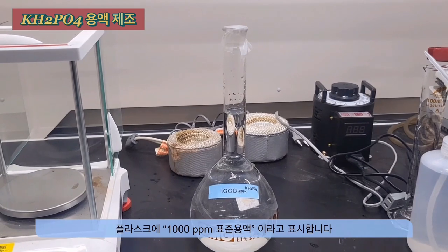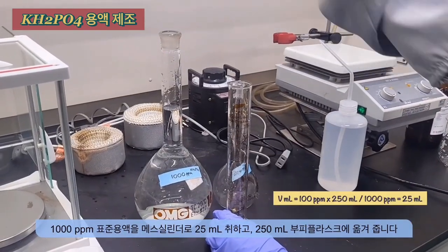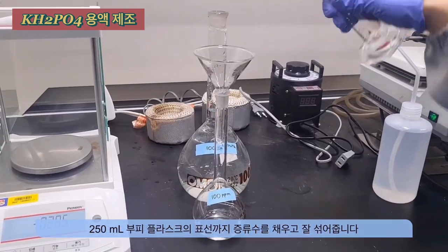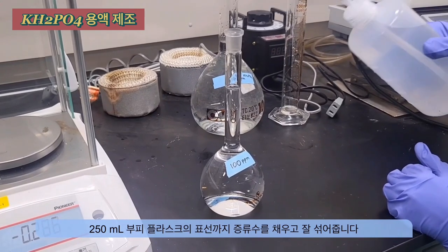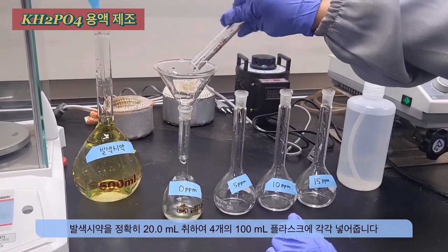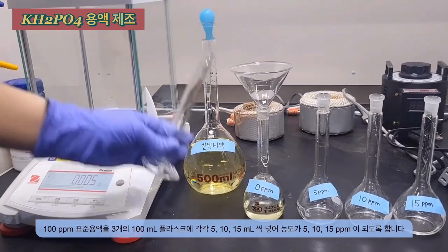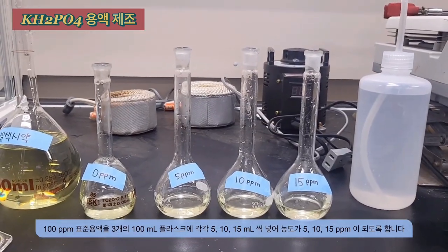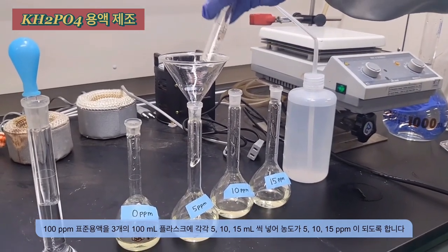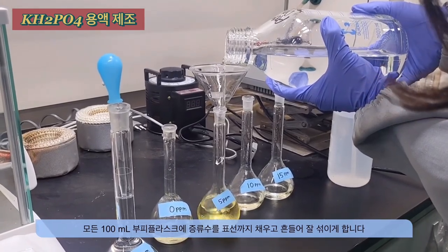Label the flask as 1000 ppm standard solution. Now dilute the 1000 ppm solution to 100 ppm. Take 25 ml of the 1000 ppm solution and transfer it to a flask, then add a small amount of water. Take exactly 20 ml of the coloring reagent and add it to each flask. Pour 5, 10, and 15 ml respectively of the 100 ppm solution into three separate flasks to achieve concentrations of 5, 10, and 15 ppm. Fill each flask up to the calibration mark with distilled water.